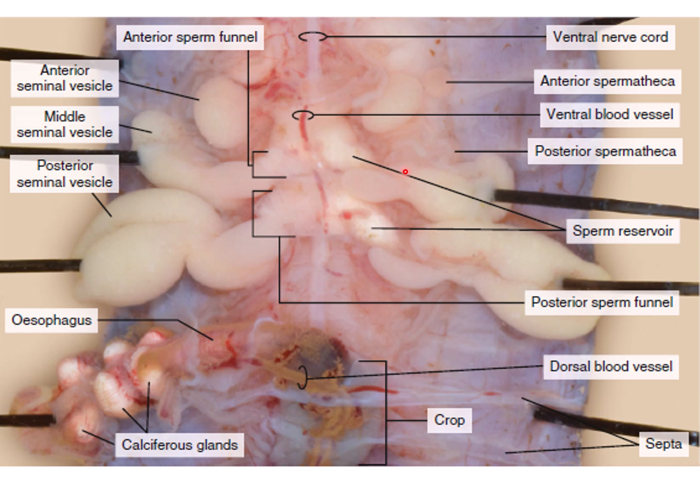The earthworms, as we know, are monoecious. They have both male and female reproductive organs. We have to see first the male reproductive organs. In the male reproductive organ, three pairs of seminal vesicles are easily observable, and they are located at segment number 9, 11 and 12. These seminal vesicles store and mature the sperms before copulation, and they are lying close to the esophagus. We can easily locate them.